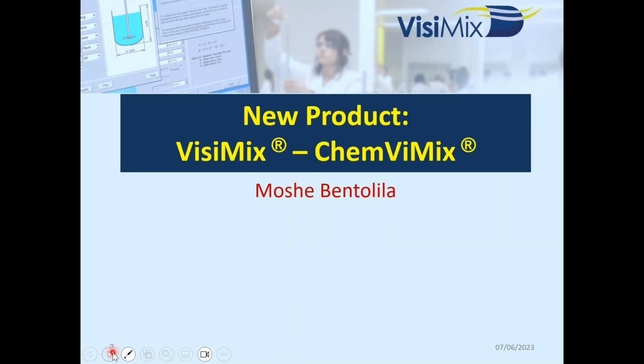What we'll do today, we'll present ChemViMix, which is chemical with the VisiMix environment, VisiMix and mixing, all of these together, coordinated in one place after a long time of trying to solve these kinds of problems. We finally have some way to model it and to generate results.